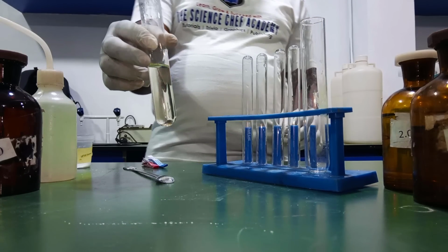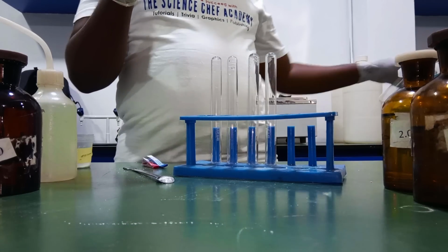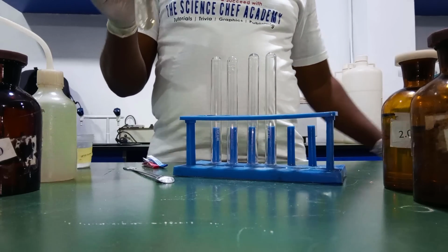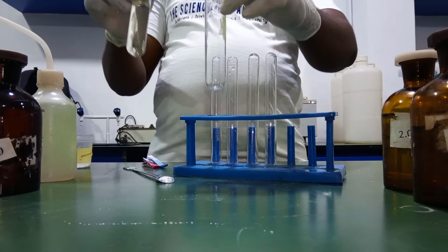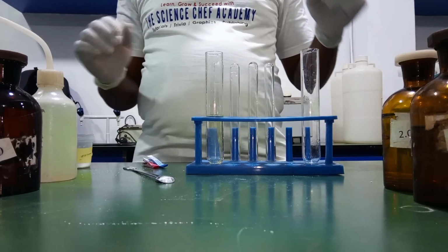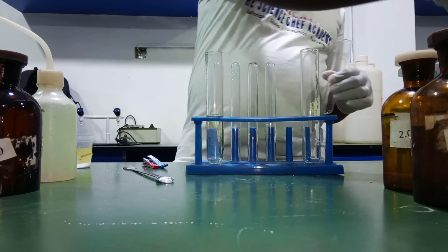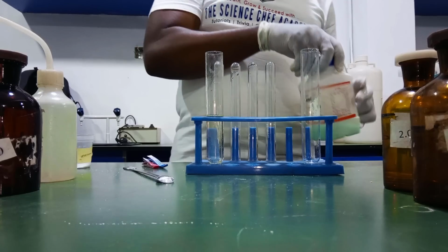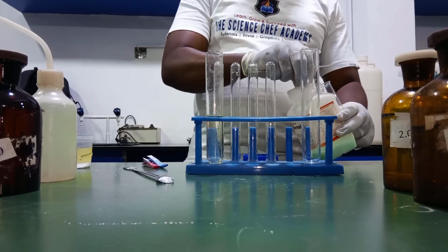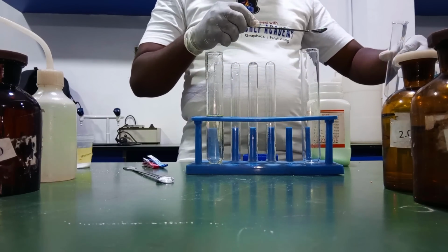Our filtrate again is sodium nitrate, NaNO3. So the ion that we'll be testing for there is the nitrate ion, and the test we'll be carrying out will be the brown ring test. So we're going to take a little portion of that. Before we do that, we need to prepare iron(II) sulfate salt. It must be freshly prepared to prevent it from being oxidized to iron(III). You can be asked that question. That's a common question in your question 3.